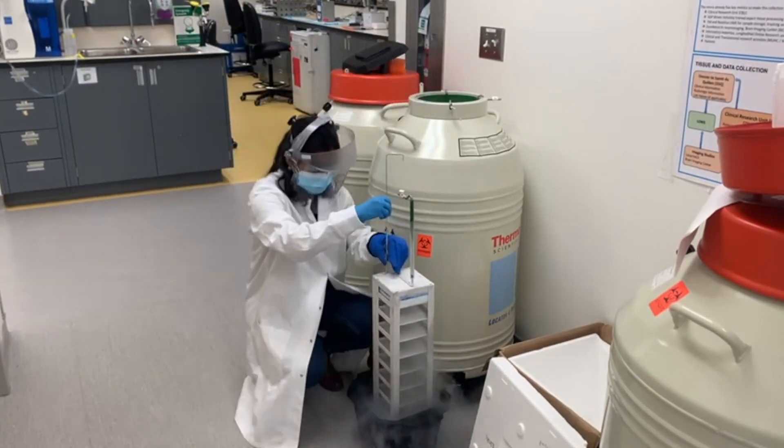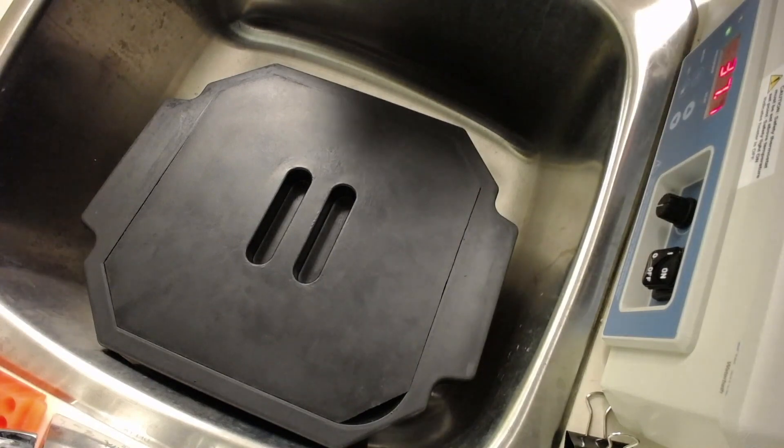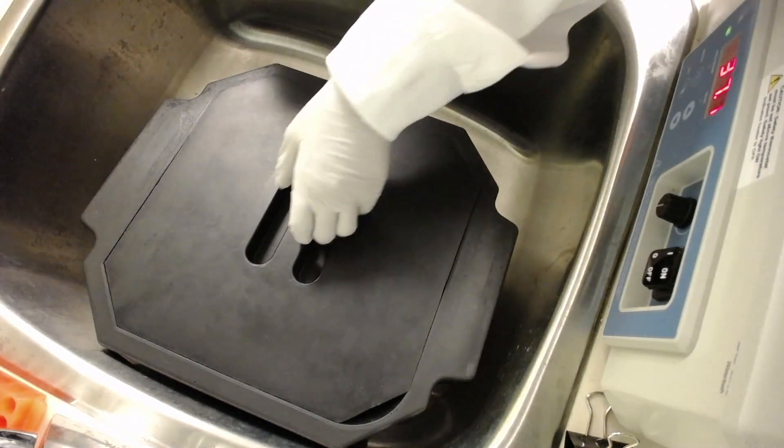Transfer some liquid nitrogen to a liquid nitrogen transfer container and add the cryovial to it. This will keep the vial frozen until cells are ready to be thawed.